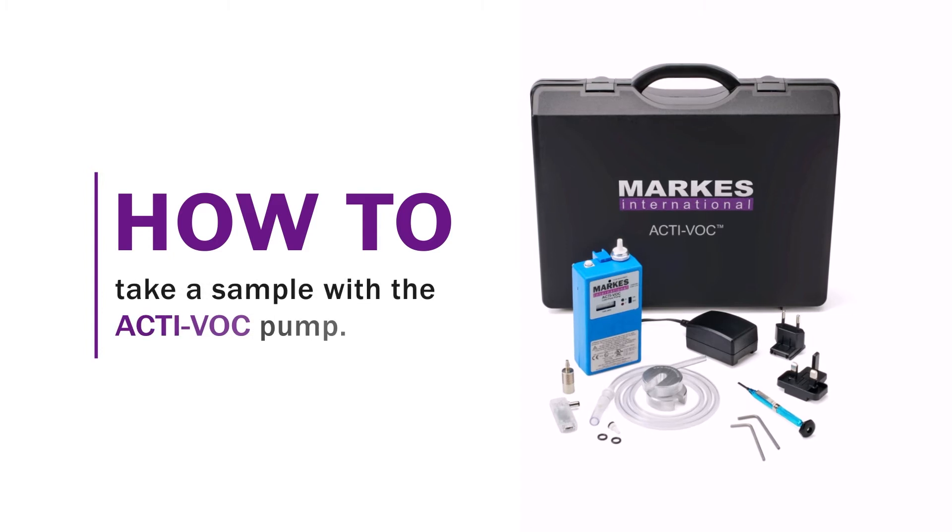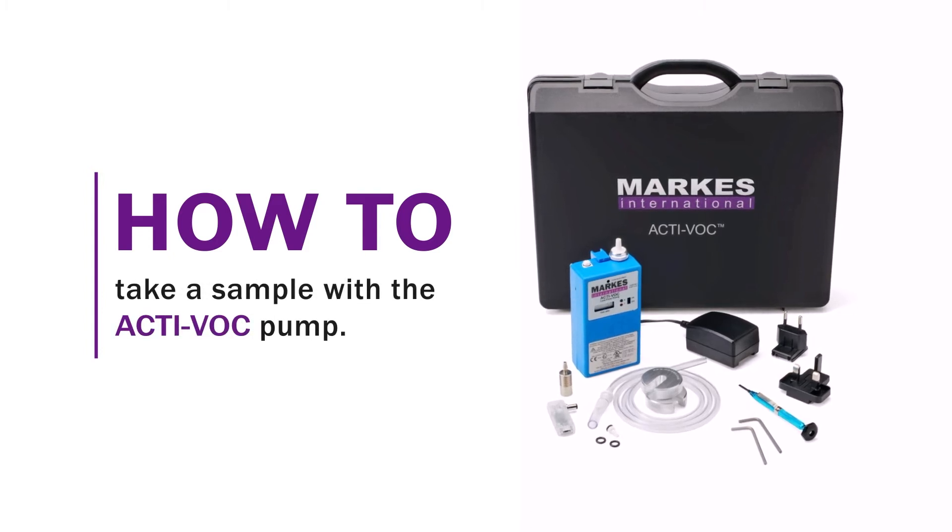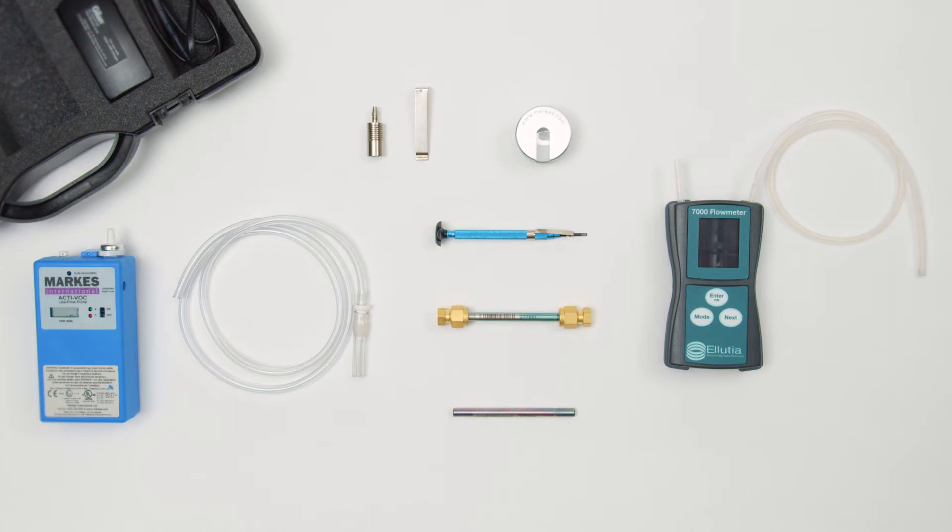The following video will show you how to use the ACTIVOC pump for active sampling onto a sorbent tube. In this video we will demonstrate how to undertake indoor air monitoring.